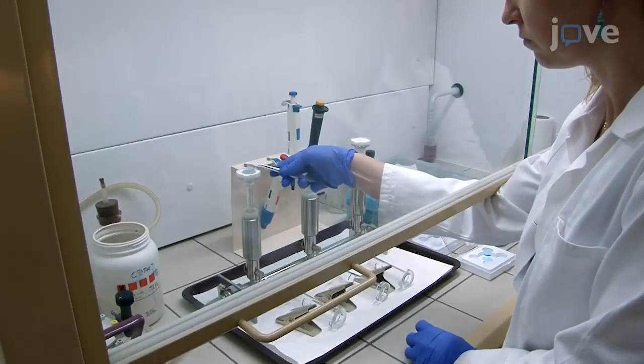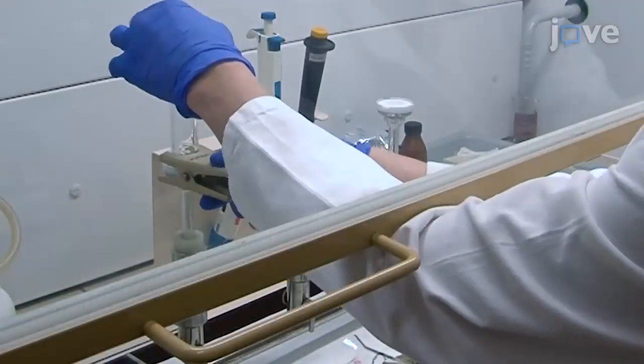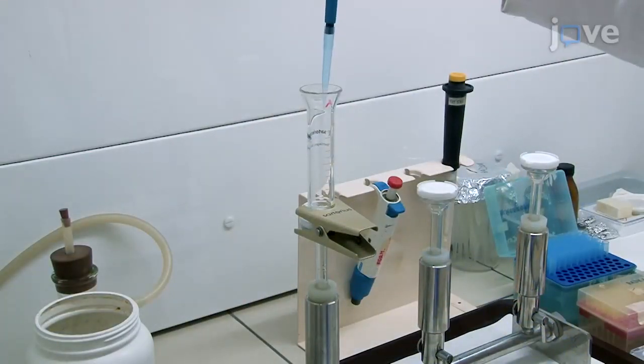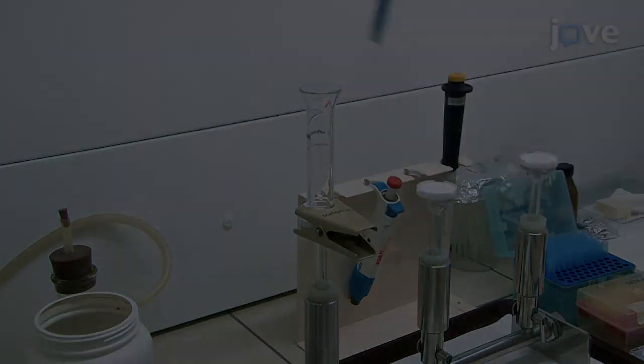First, use a filtration funnel and black filters with a 0.2 micrometer pore size to filter 1 to 2 milliliters of the reservoir water or 10 to 30 microliters of the trap fluid subsample.